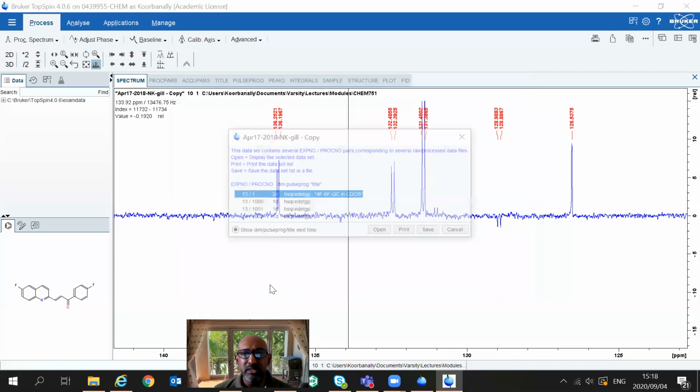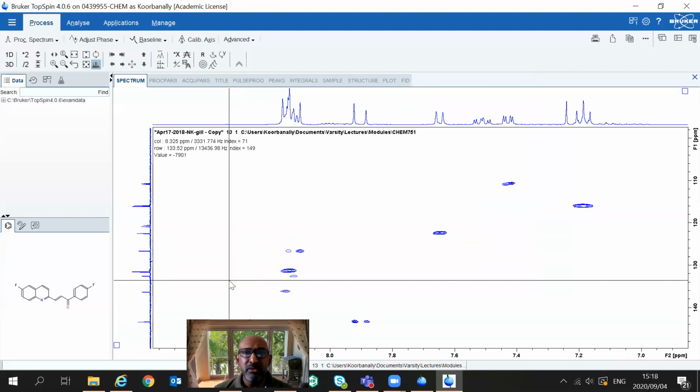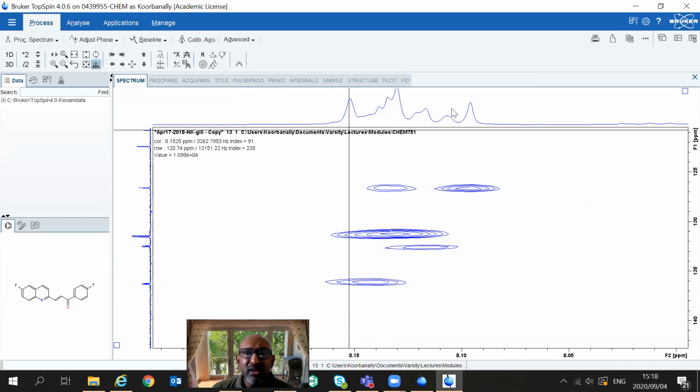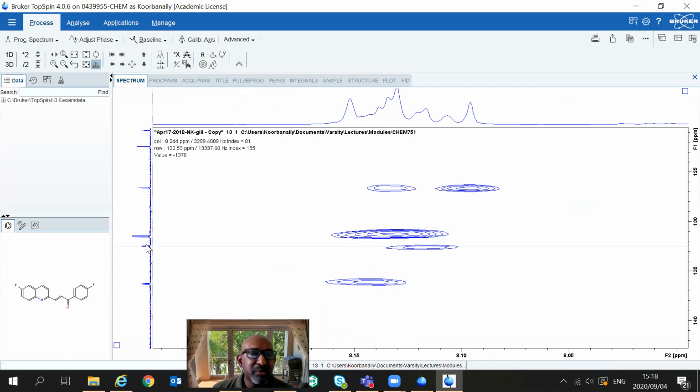and open my HSQC. All right, so I'm back here with my HSQC and I'm now looking at this particular area and I'm saying, okay, what's nice is that I've got the 5 protons on here. So I can say that these 2 are metacoupled protons, right? One is this, because these are metacoupled protons, right? That is also a metacoupled proton here, right? So this is going to be one, that's going to be the other one.